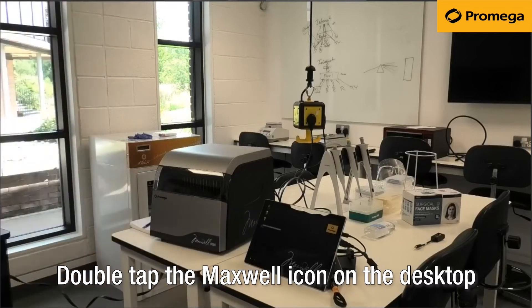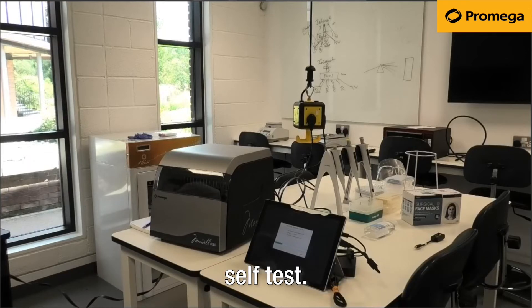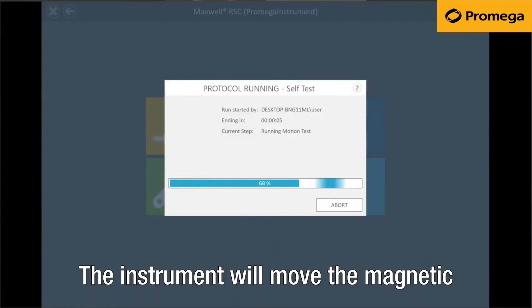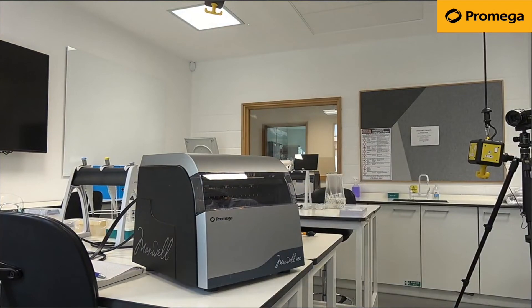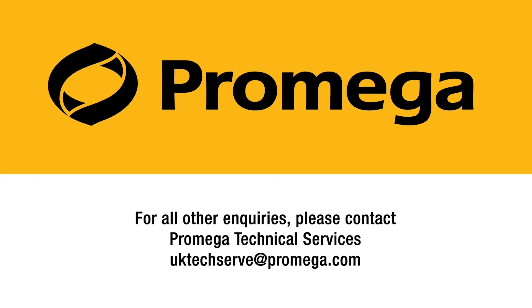Double tap the Maxwell icon on the desktop to open the software. During initial startup, the instrument will run a self-test. The progress bar on the screen displays the steps conducted during this test. The instrument will move the magnetic rod assembly, plunger bar and deck tray. When this test is complete, the home screen of the Maxwell software will be displayed and you will be ready to go.